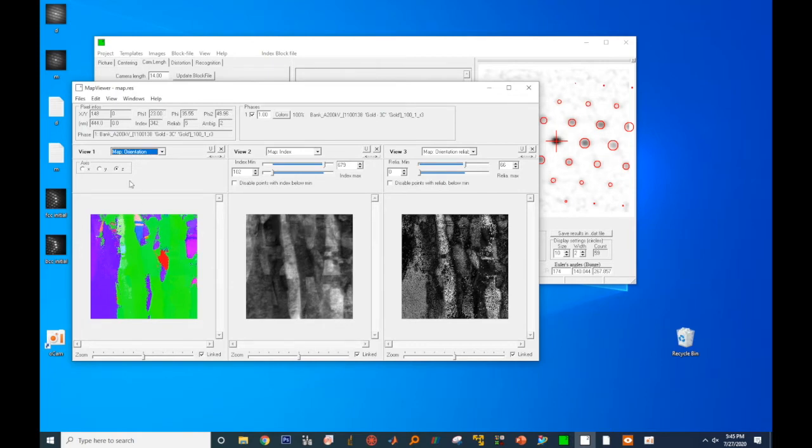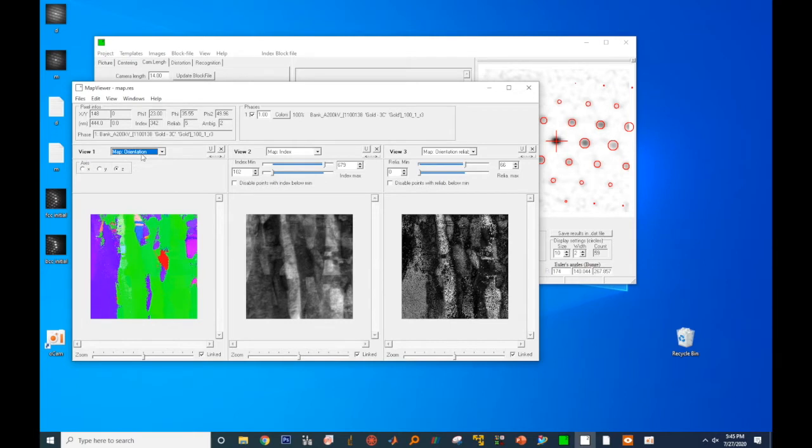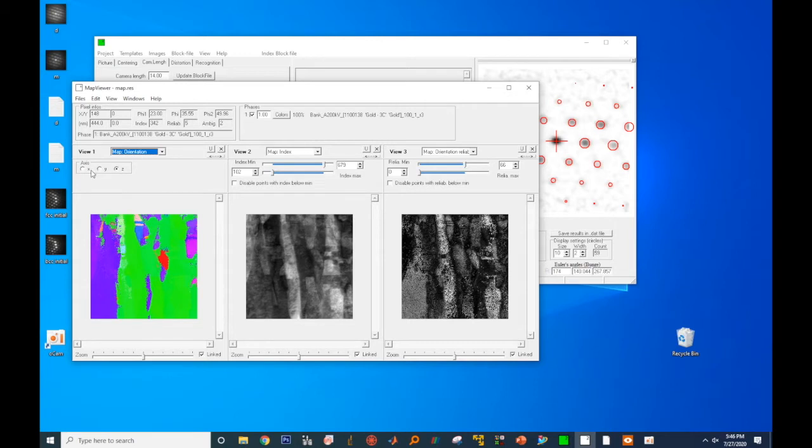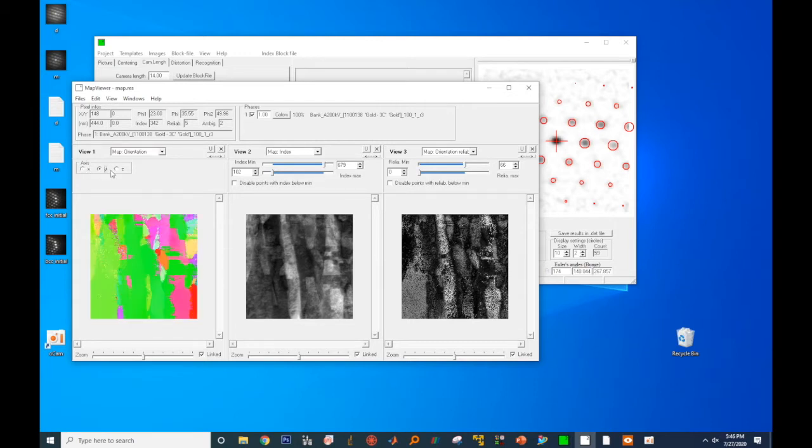In the first viewing window, it is an orientation map. Right now, the Z tab is selected, so we're viewing the orientation map along the Z axis. It is the out-of-plane orientation map. You can also click on the X and Y viewing axis to get the in-plane orientation maps.